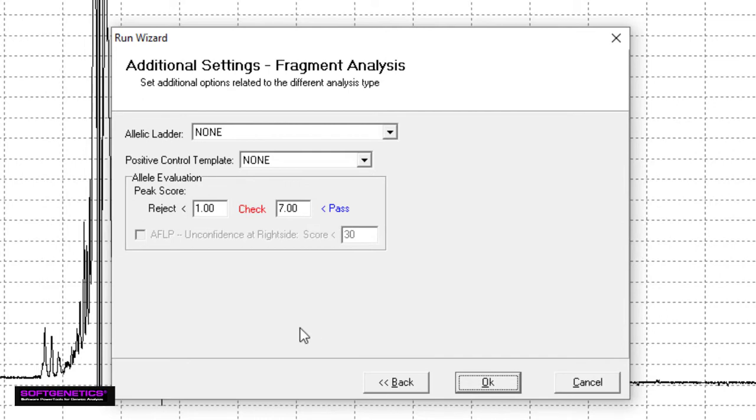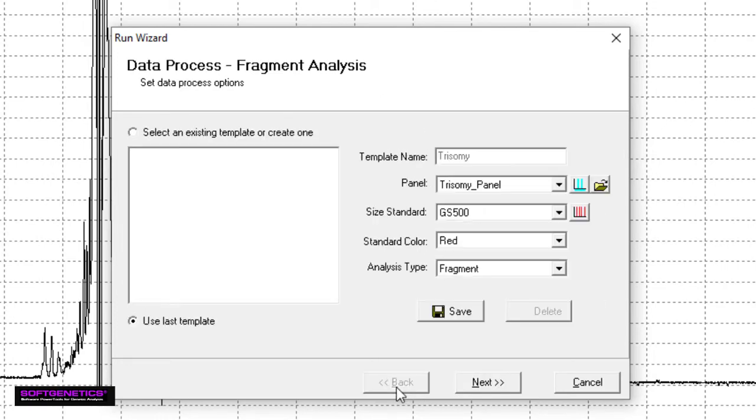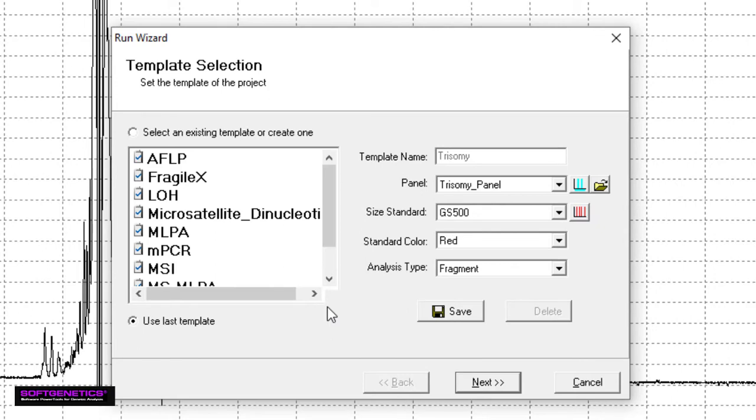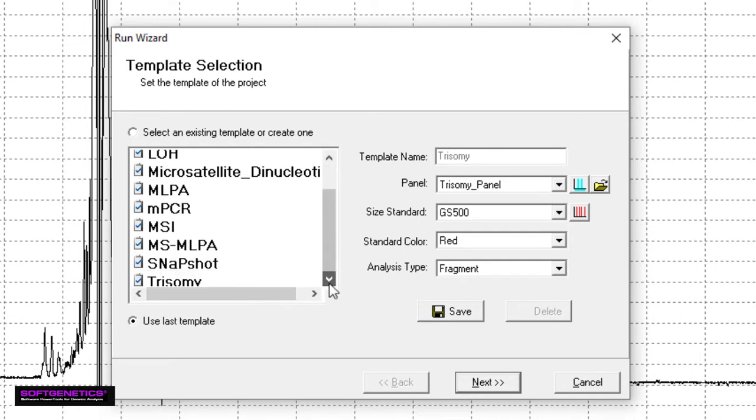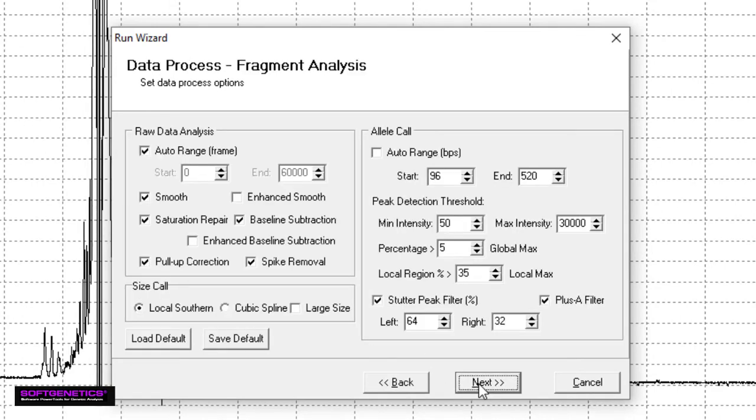On the last page of the run wizard, you can select an allelic ladder and positive control template if you have them. And you can also adjust how alleles are scored. Before continuing, I'd like to go back to the first page of the run wizard. All of the settings we've just covered can be conveniently saved as a template. As you can see here, I have many different templates, each for different analysis types. With this feature, I must only adjust my parameters once for each new procedure. Now, I can simply select my template, click Next, Next, and OK.